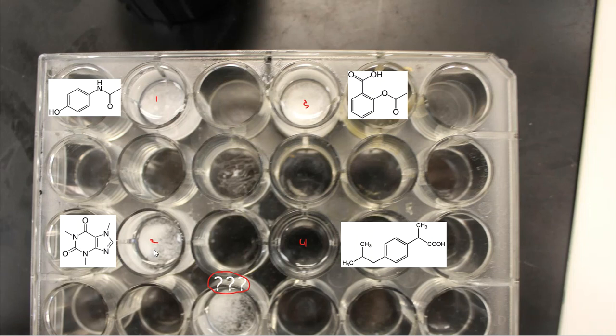So not even making it to the TLC plate at this point, I do not want you to tell me that ibuprofen is your unknown. If so, I should just automatically put an F on your lab grade and give it back. So I'm already eliminating one of those choices from you. I want you to actively think through these lab steps. And that is an active thinker right there, because they automatically are going to tell me it can't be number four. It can't be ibuprofen. It's either going to be the Tylenol or the aspirin or the caffeine, because those stayed somewhat white crystalline powders and they didn't fully dissolve. And that's how my unknown worked as well. So do not give me ibuprofen as the unknown identity.